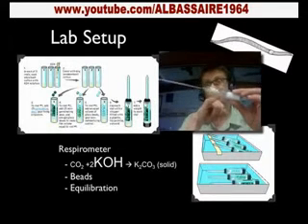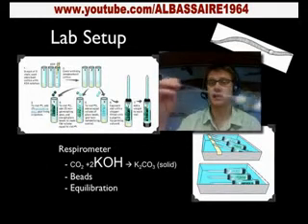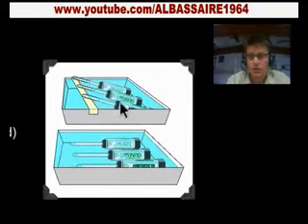And so you've got your organism in here that's going to respire. You've got this pipette that goes out the side, and then what you'll do is you'll just set it in water. And so this diagram right here shows that. So we're putting all of our respirometers right here in water, and then we just let them sit and equilibrate. In other words, the temperature inside there has to be equal to the temperature of the water.